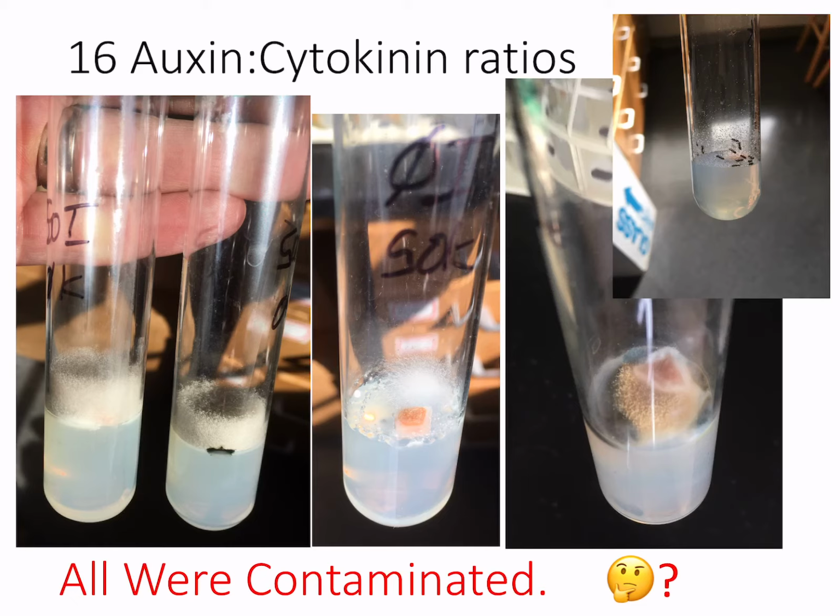It's just a failure. And of course, anytime an experiment fails, for whatever reason, you want to think back to what was done and ask yourself why, and see if you can pinpoint something that was the reason why it didn't turn out the way you expected.